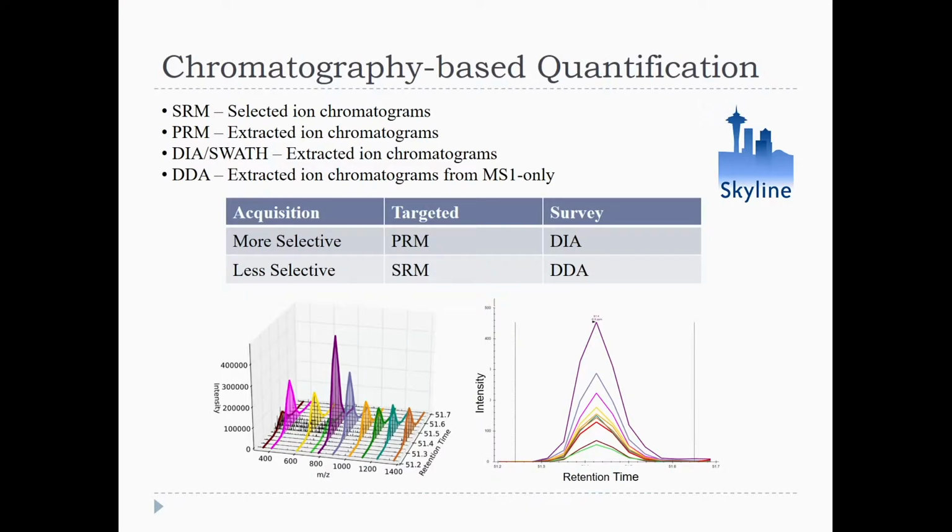You can see that Skyline started, if you came this morning, you've seen this chromatography-based quantification. Skyline definitely started with SRM, as did the Aebersold lab. We were all on the same journey, and I've been coming here for, I think, 7 years. It's been fantastic. I really love this group, and I always go home with, oh my gosh, I have all these ideas.